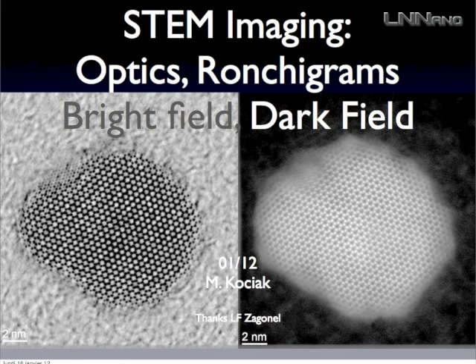So this is one way of making an image with a STEM. It has been done with a corrected machine, but this is not the point here. Because it has been done with a corrected machine, you can see all the black dots here are atomic columns. So it's bright field, so it's more or less like a standard TEM image. You see here a carbon foil, this background here, and you see atoms everywhere. So this guy was very happy because it was very crystalline all over the structure. And you see that there is some small change here. And you can see here as well individual atoms or atomic columns.